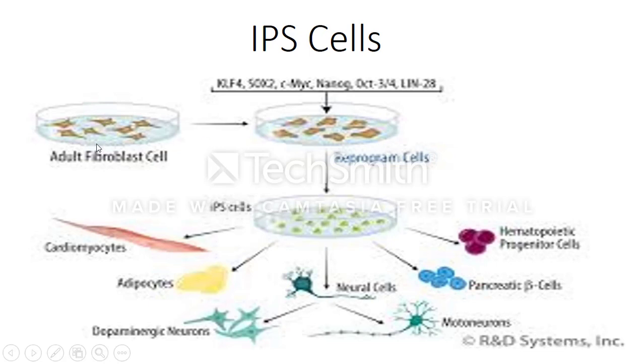Now, what you can also do with these is you can just get to these iPS cells, and we can just better study them.